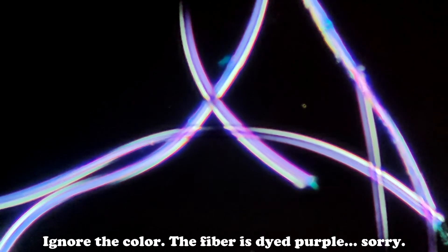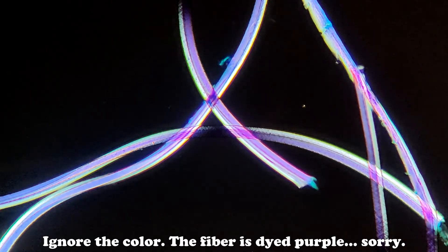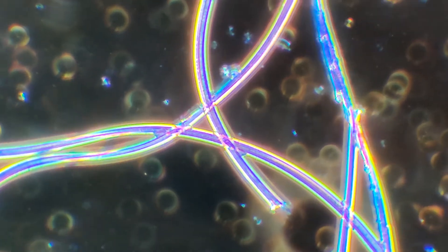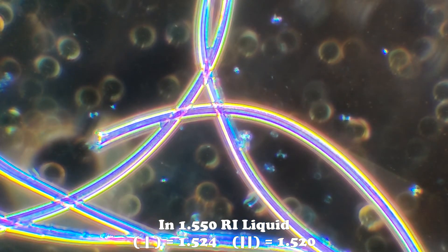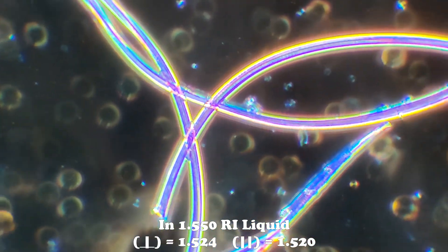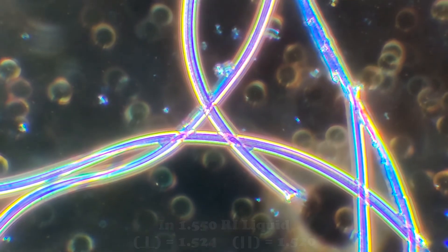Under cross-polarization, Orlon exhibits a low but uniform birefringence. Under dispersion staining in 1-5-5 refractive index liquid, you'll find that Orlon has a very uniform dispersion staining color, regardless of orientation.